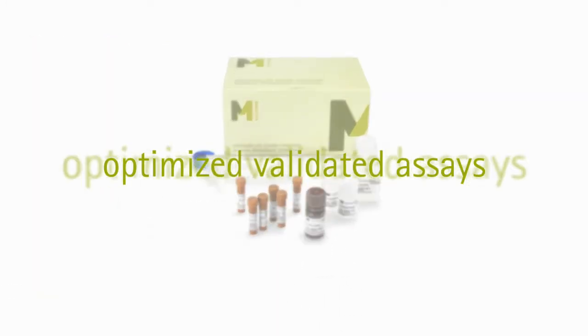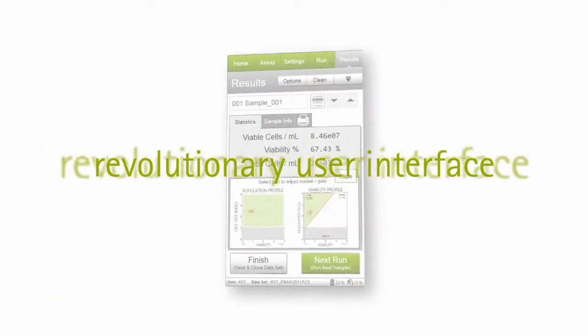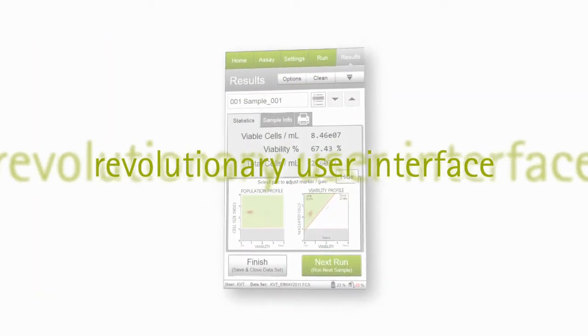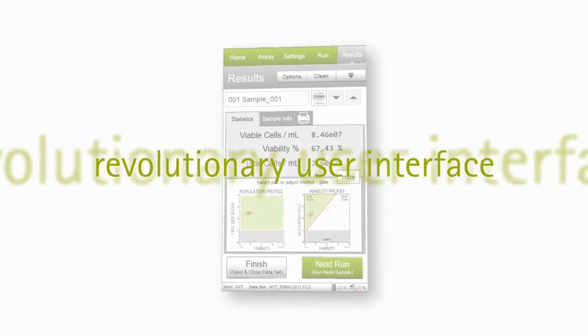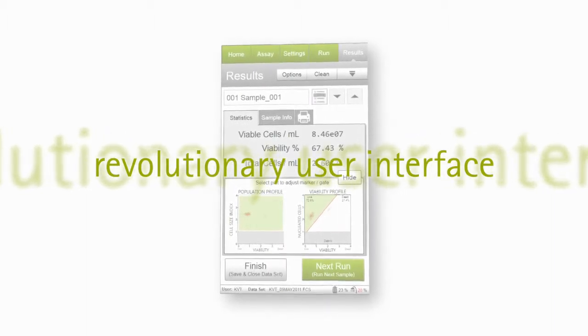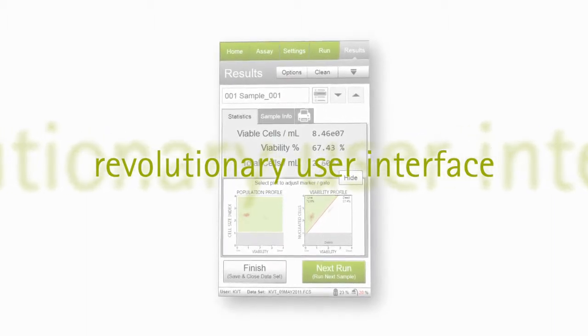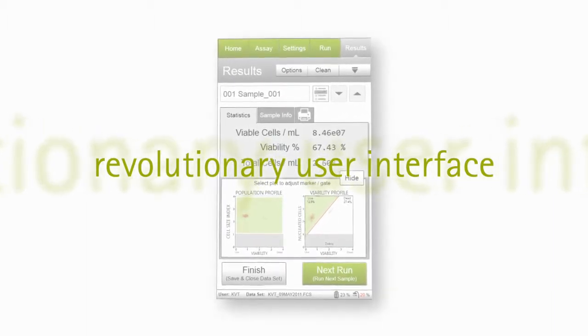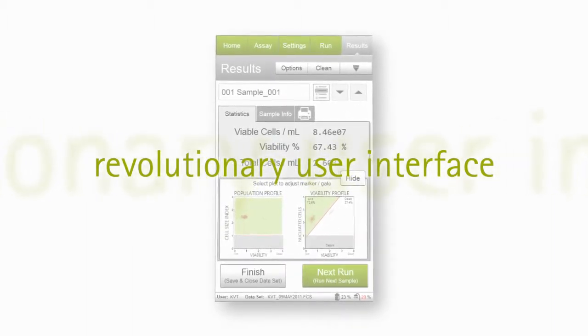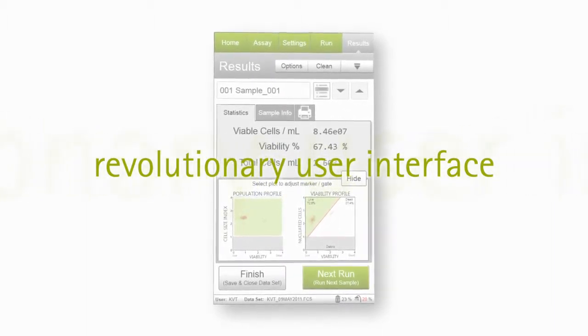With validated assays and a revolutionary user interface, it offers ease of use and true convenience to address the needs of any cell biologist.